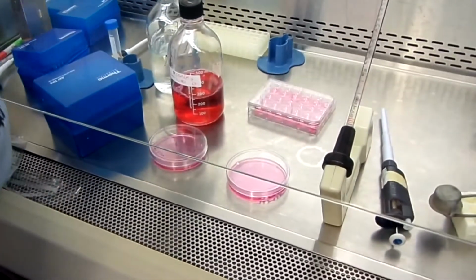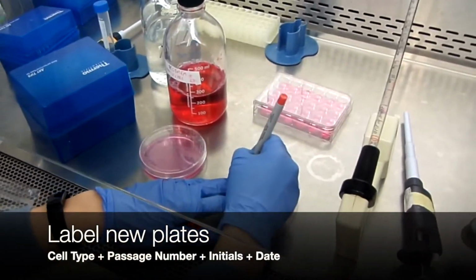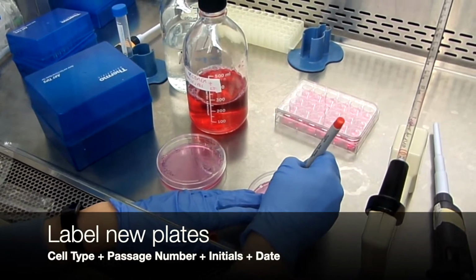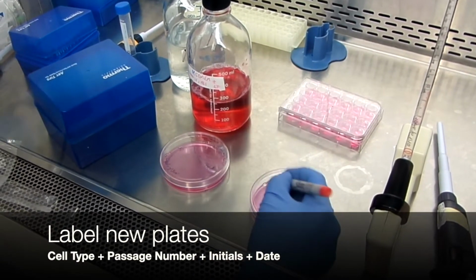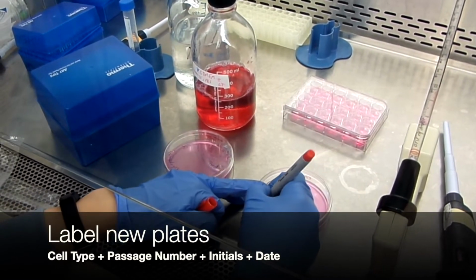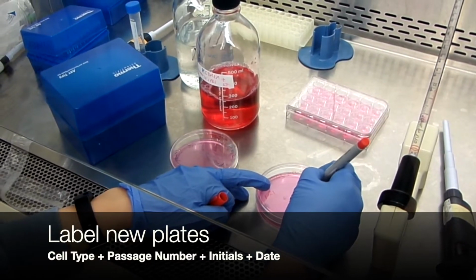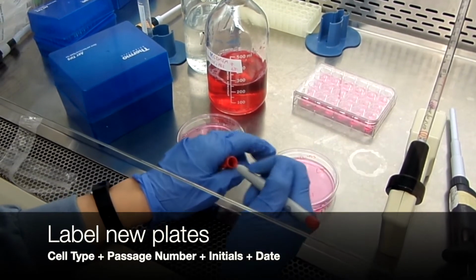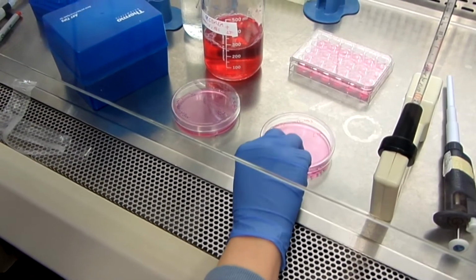In order to finish, you need to write the name of the cells. So mine are MDA MB 453. Passage number, how many times you have done this passaging experiment. So this is passage 21. You need to write your initials and the date. And now you can put them back in the incubator.